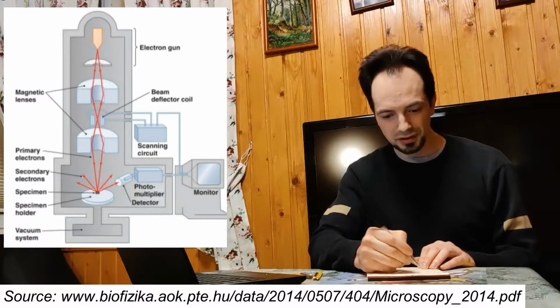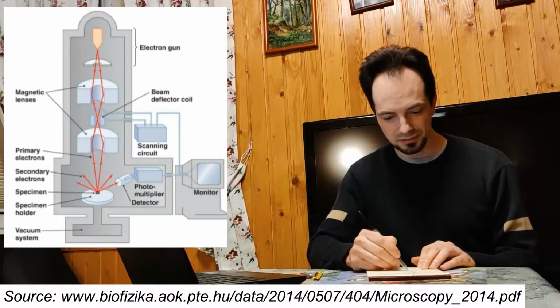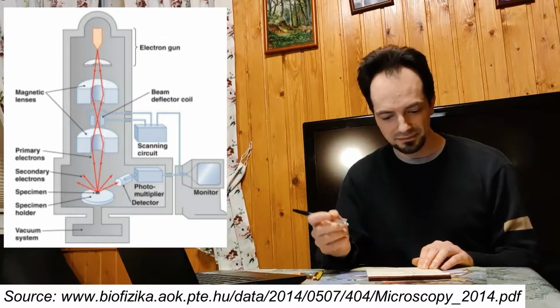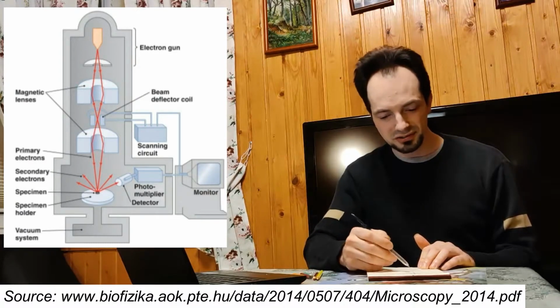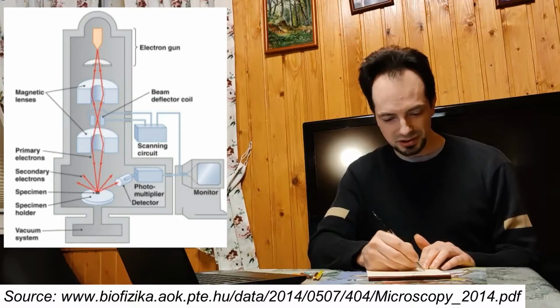And the whole thing is inside a vacuum chamber. So the whole thing is inside vacuum. Sometimes there is a lock chamber here to enable quick sample exchange. But the basic scheme is such: an electron gun, beam preparation system, beam deflection system, sample stage.